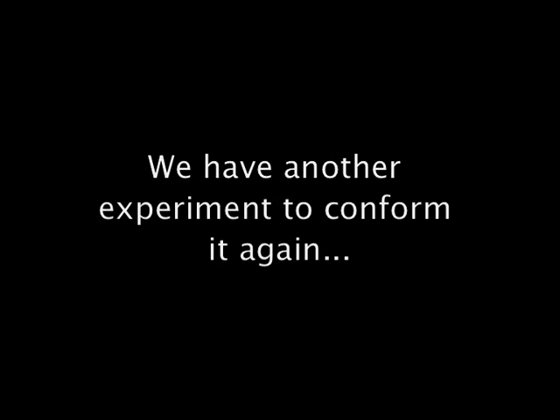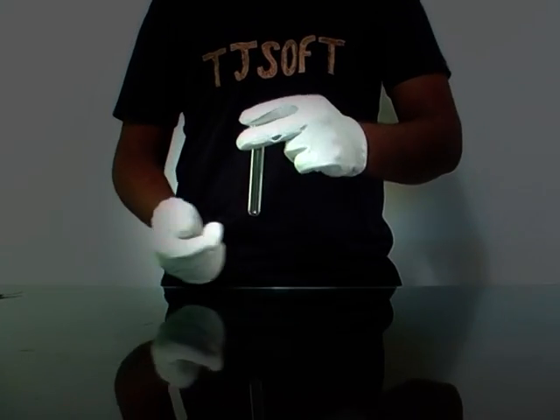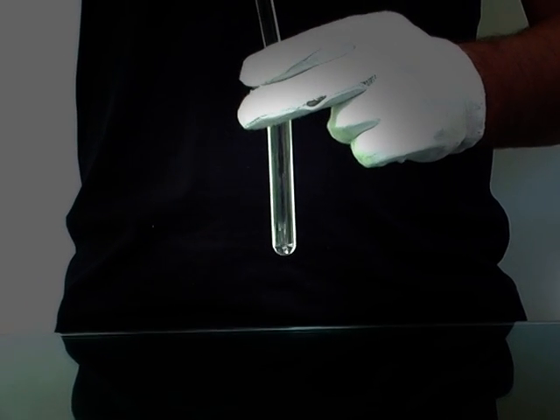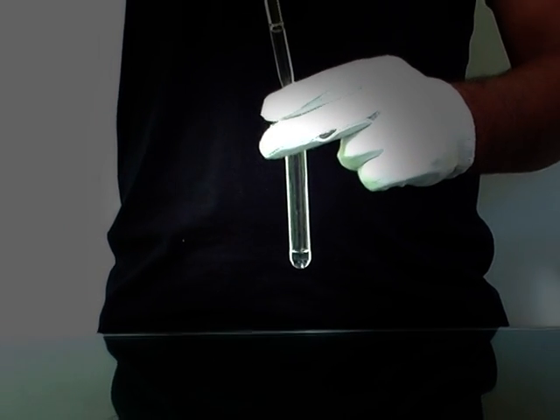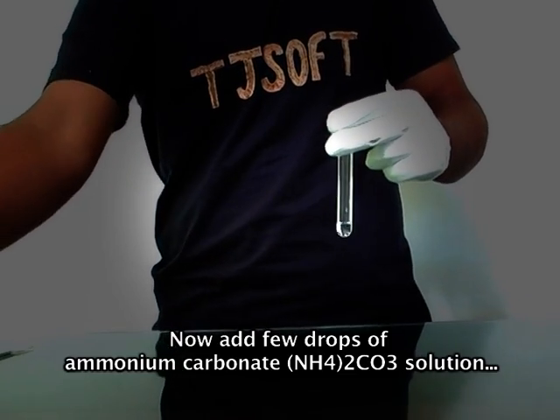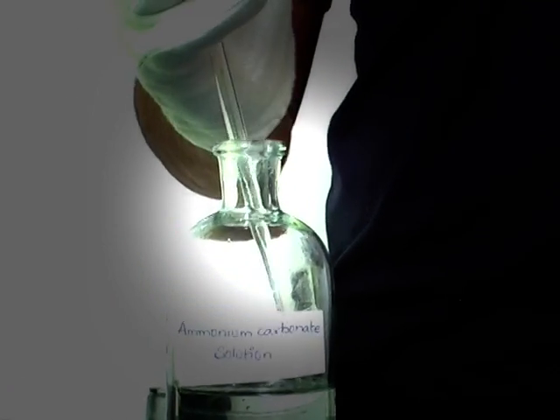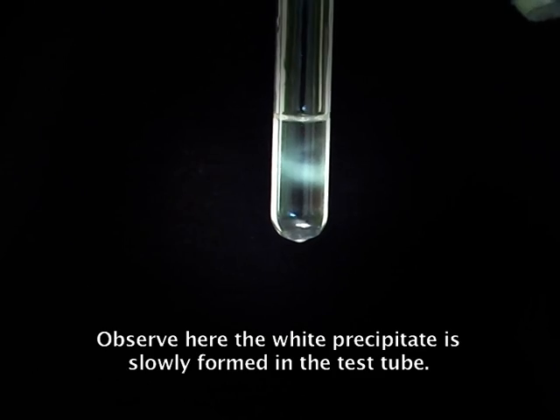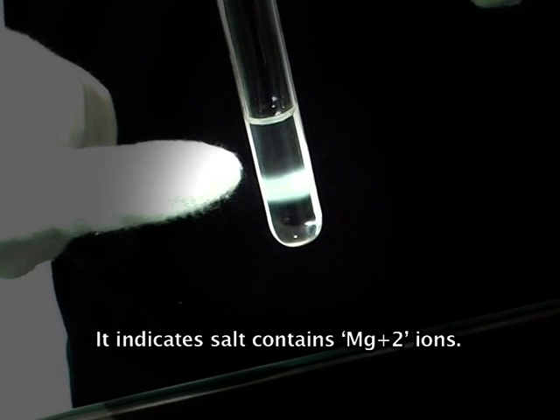We have another experiment to confirm it again. Take another test tube and add few ml of original solution to it. Now add few drops of ammonium carbonate solution to the original solution with the help of a filler. Observe here the white precipitate is slowly formed in the test tube. It indicates that the salt contains magnesium ions.